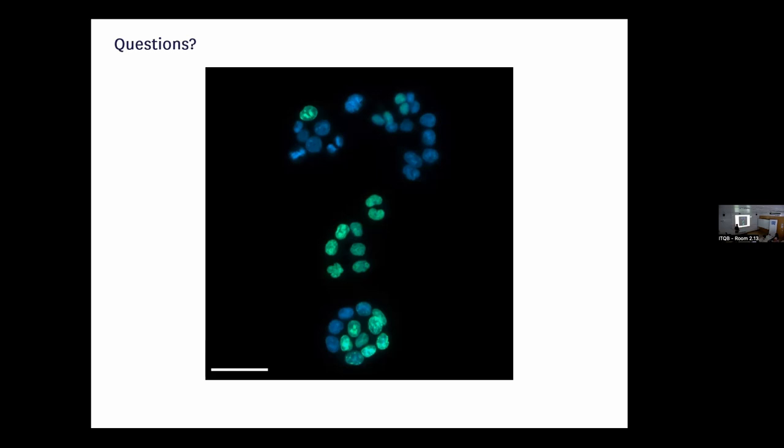For instance, if I have 3 channels and I have 3 fluorophores, and I only want to use one of the pairs for FRET, I can also image the third one. Sure. Yeah, but with the third one, you would not have the same spatial information. We could only tell that it was in the 200 nanometer range, not in the 5 nanometer. But sure, you can combine this with multiparametric imaging of other fluorophores. But for the FRET, you need the FRET pair.